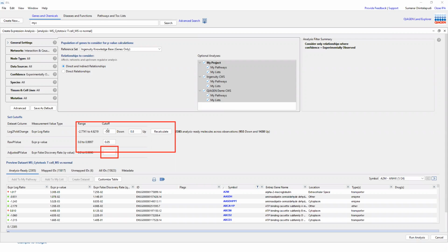This pathway always shows up whether my filters are strict or relaxed, so you can rely on that result much more. And when you're writing up the paper, you can just take that information. So run this analysis 3 times, and see if it makes sense to you when it comes to your biological interpretation for that experiment that you're running.